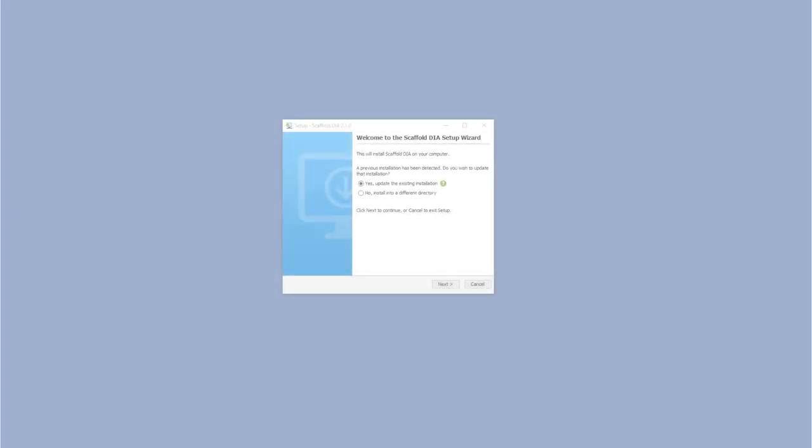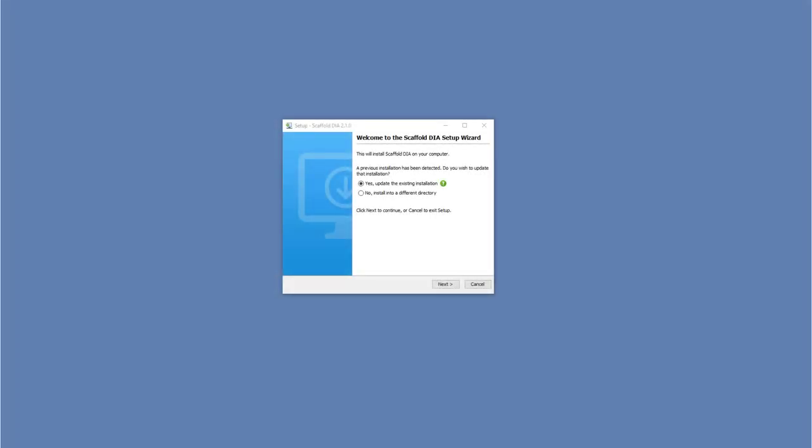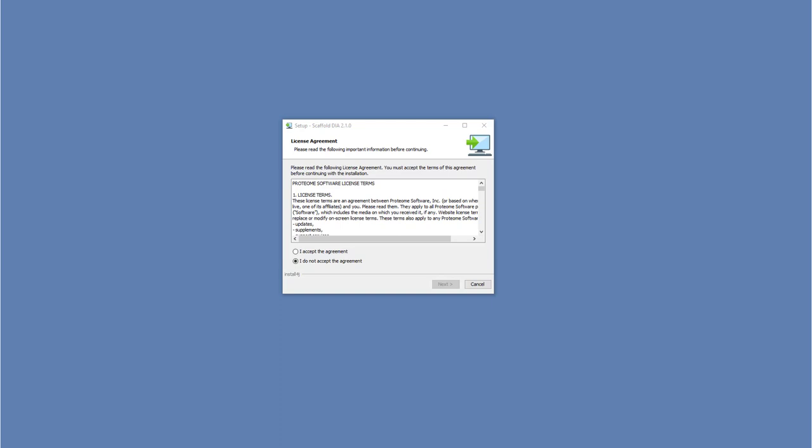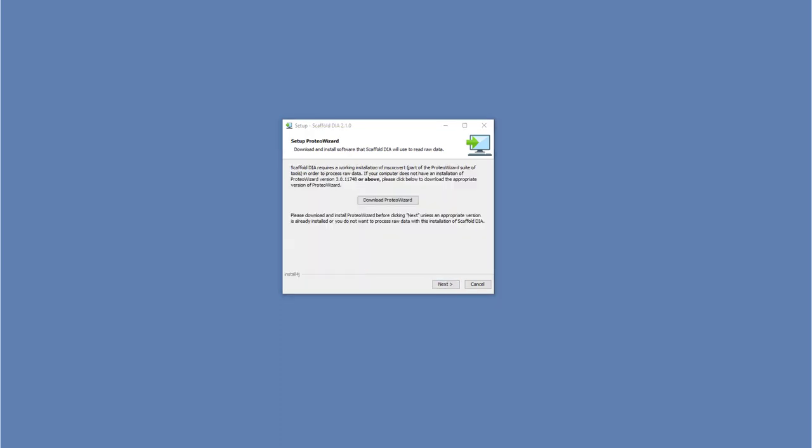We will now begin working our way through the installer. In most instances, simply accepting the default option for the installation directory is appropriate. This will overwrite a previously installed version of Scaffold DIA. Please note you must accept a license agreement to install Scaffold DIA.